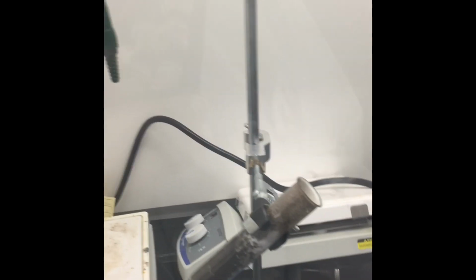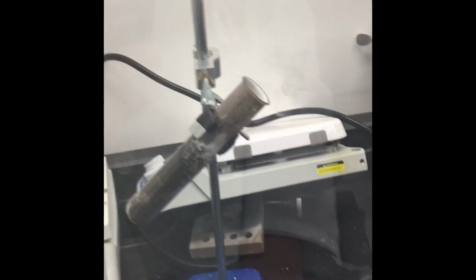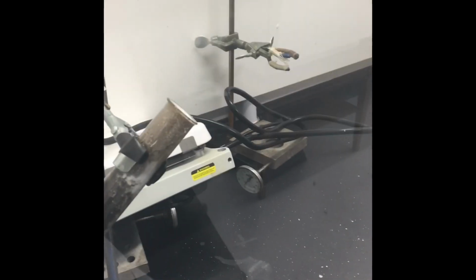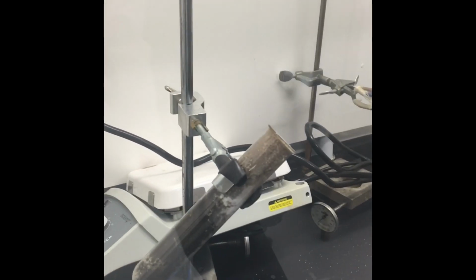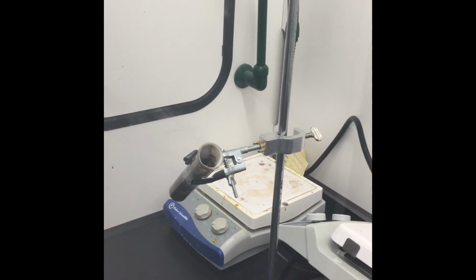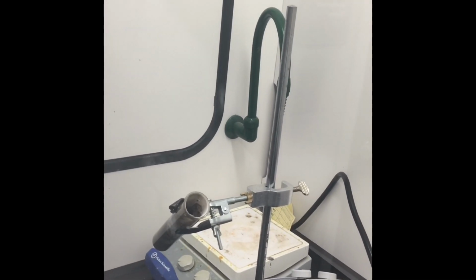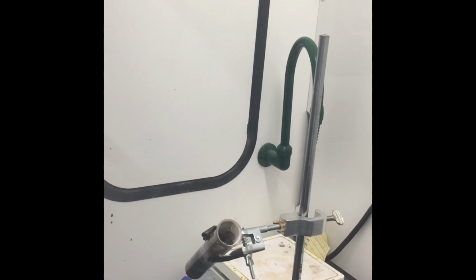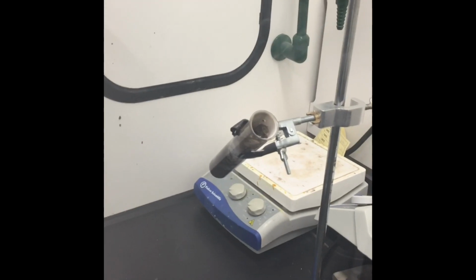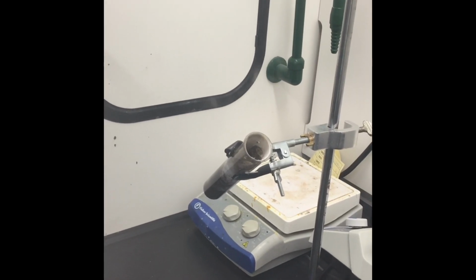You can see that there's still some smoke there. It's still a combustion reaction. I'm gonna wait a little bit to make sure that the smoke is subsiding, and then we'll see how the test tube looks inside. Let's see, I really can see a little bit from here. There you go. And of course, I have the hood on to make sure that all those gases do not come towards me.